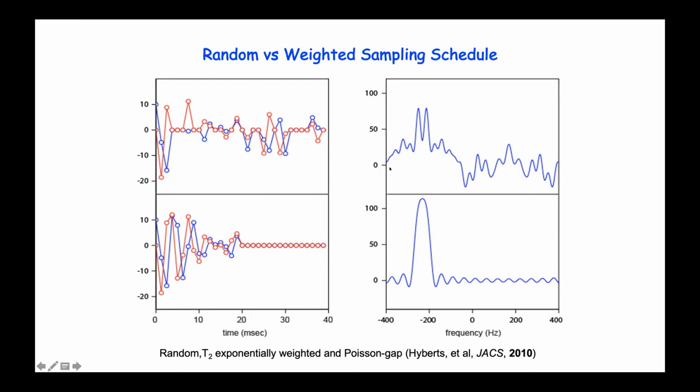And so to me, fortunately, we are more resolution limited than signal to noise limited. So random sampling is mainly what I do for my experiment, and so far it has been working fine. With some of the sampling schedules, for example Poisson gap, I found that if you weight them, the peak could be distorted significantly so that SMILE actually performs a little bit less than random. So this is my perspective, and it could be long, and we can discuss about this later.